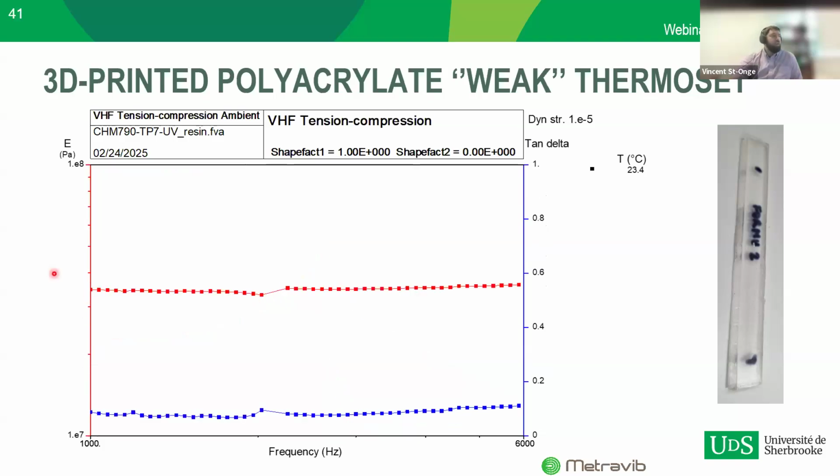And then we could extract the modulus, and the modulus was consistent with the Young modulus that we had measured by another method. And the tan delta at 0.1 is also something that is very consistent with a thermoset. So again, the VHF TEN4 was able to provide such a measurement much faster than a classical DMA would have. And we were able to obtain those results for very different types of materials.